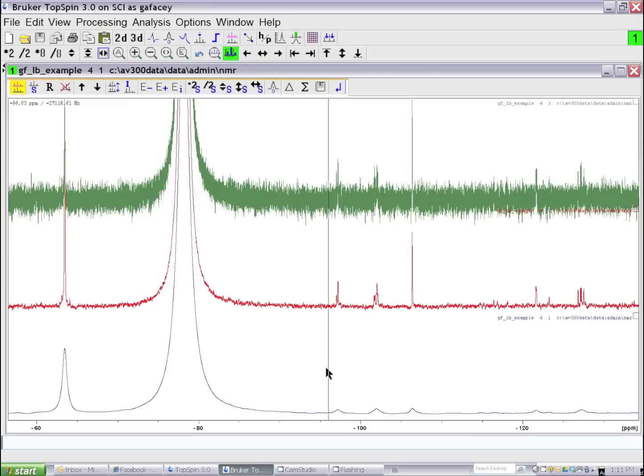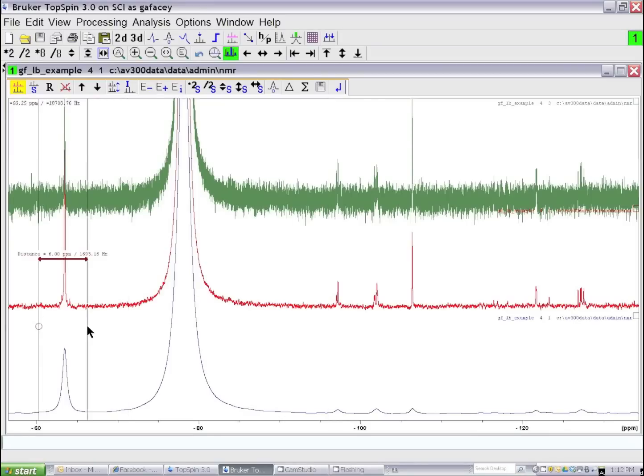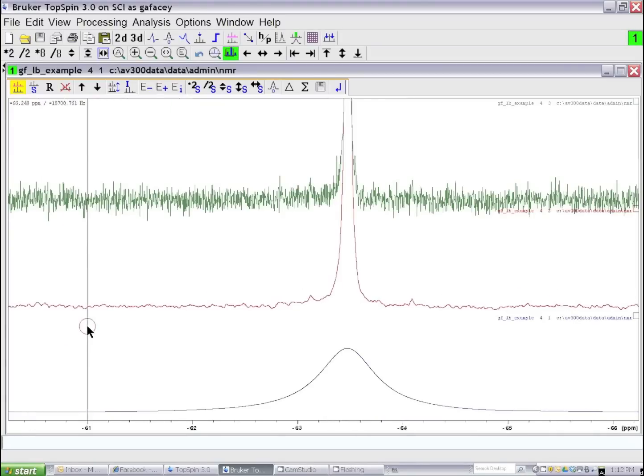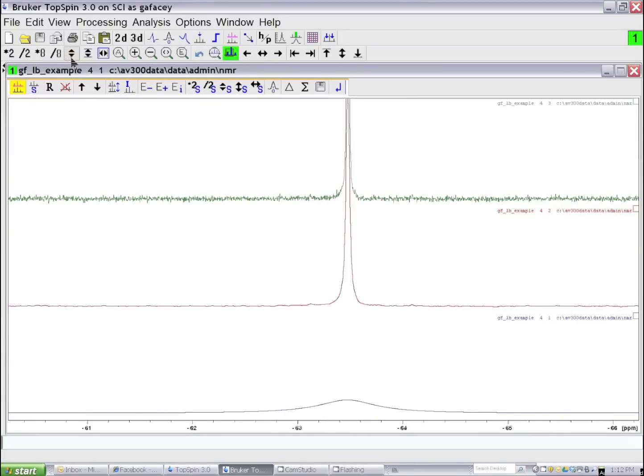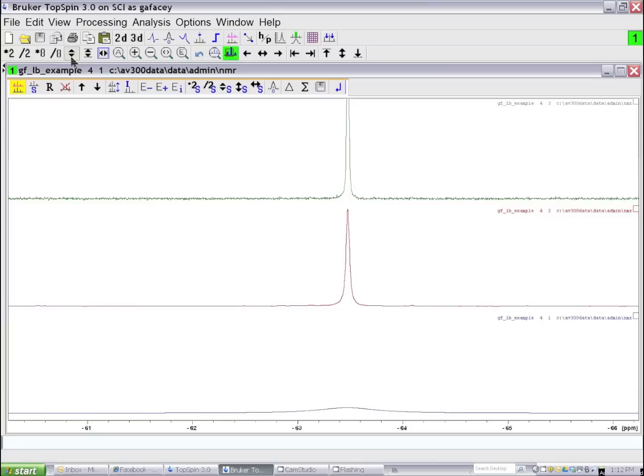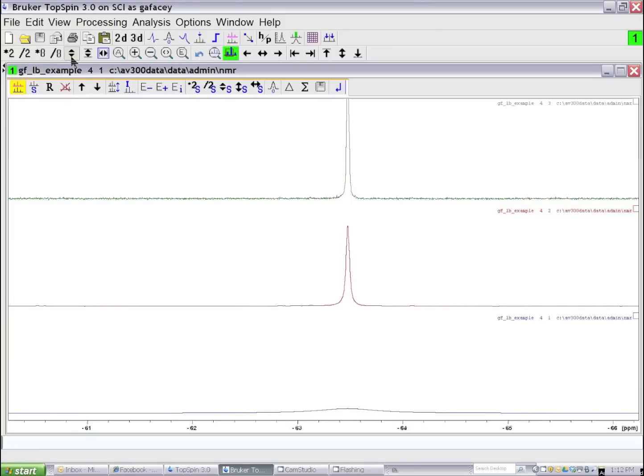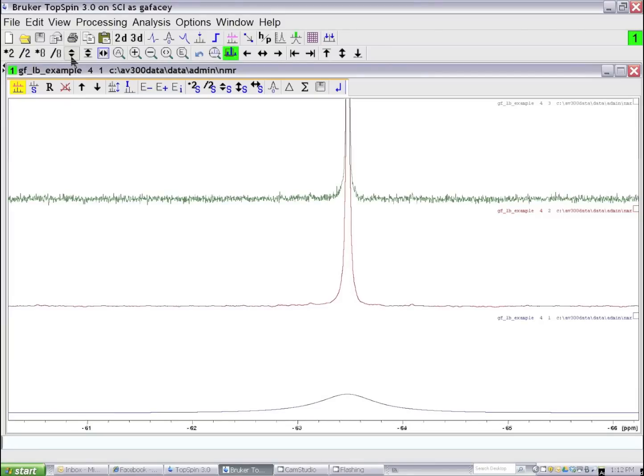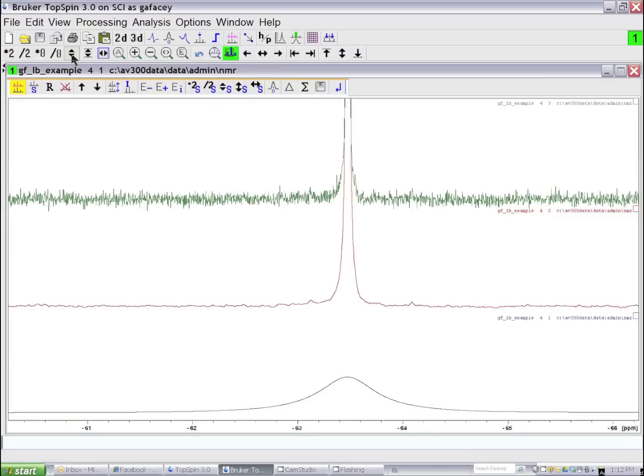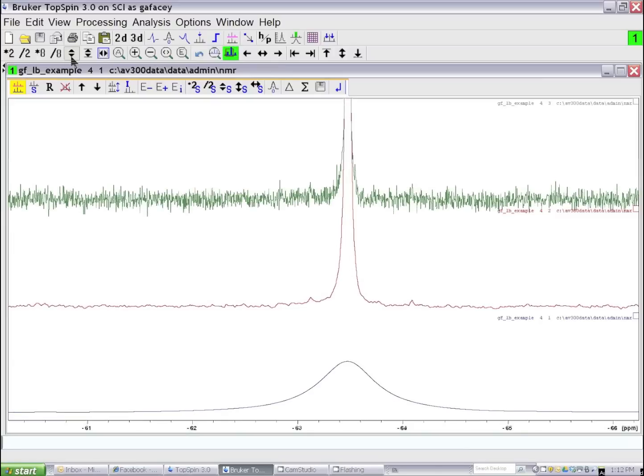First, if we look at the line which we assumed was the sharpest line of interest in our spectrum, you can see that the signal-to-noise ratio in the middle spectrum is certainly the best, and the line is excessively broad in the one where we used 180 Hz of line broadening.